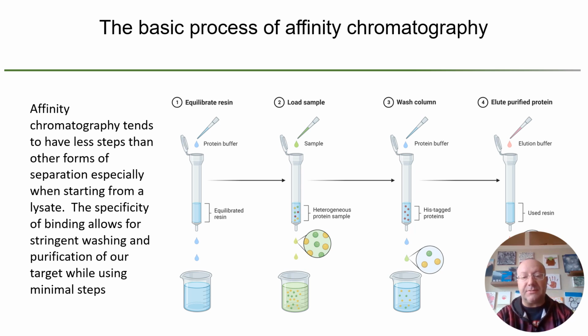So the basics of affinity chromatography are that it tends to have less steps than other forms due to the specificity. The specificity of binding allows for very stringent washing and purification with very minimal steps compared to ion exchange, size exclusion, hydrophobicity, and other types of chromatography.